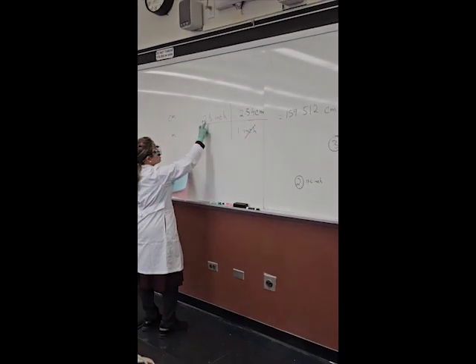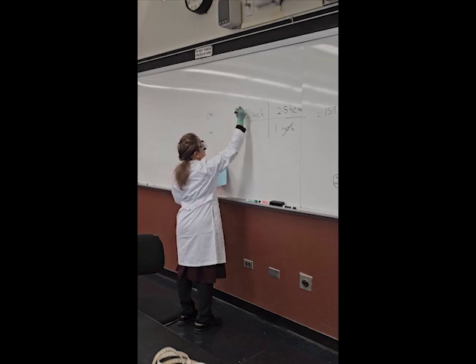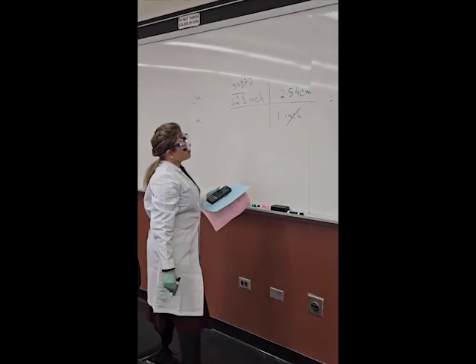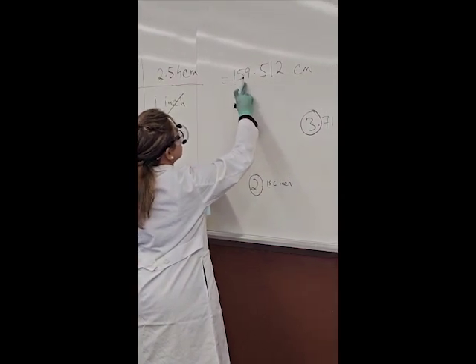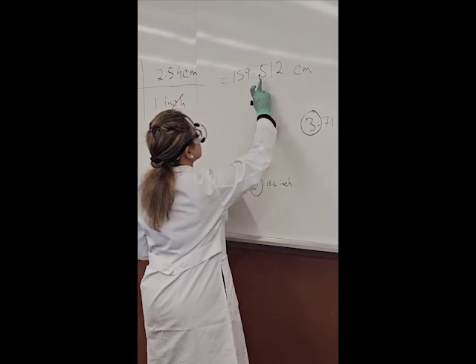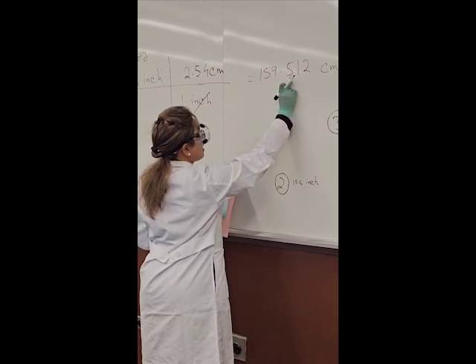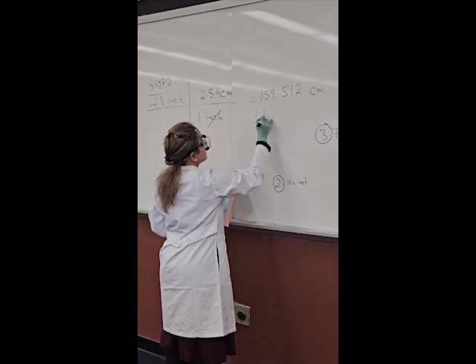Okay. Here, I took my data in 3 significant figures. So my answer should be in 3 significant figures too. So 159.5, right? If I want to get 3 significant figures, so 159, as it is 5 or more, we will round it off. So it should be 160.